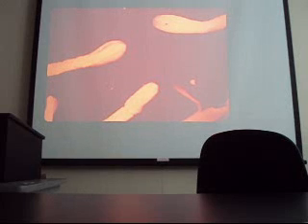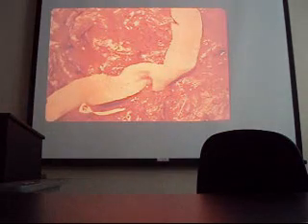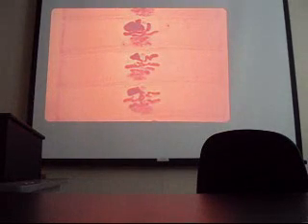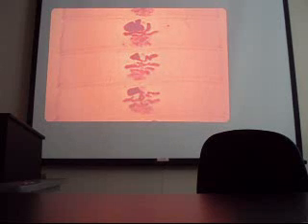I haven't tried to find the head in there, in the jar. It's in there. No hooks. This is an unarmed scolex. Tapeworms. Well, we have some really good examples now. Here's the rosette uterine branches of Diphyllobothrium latum.